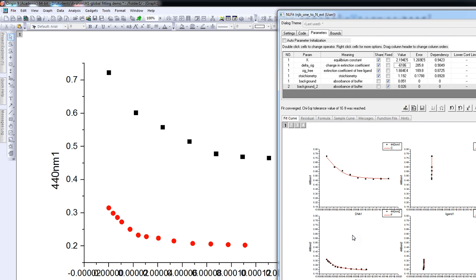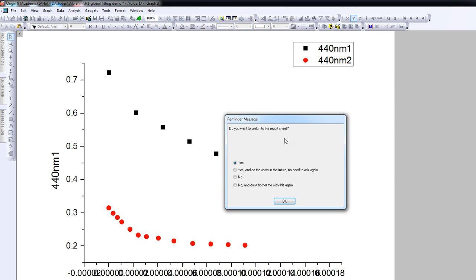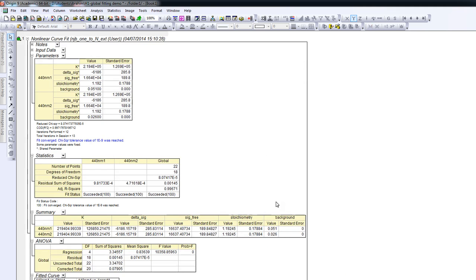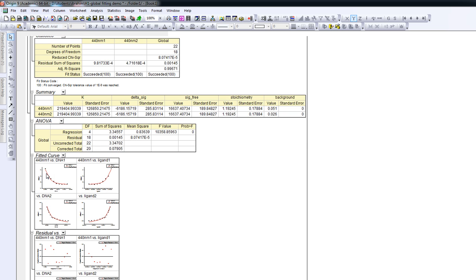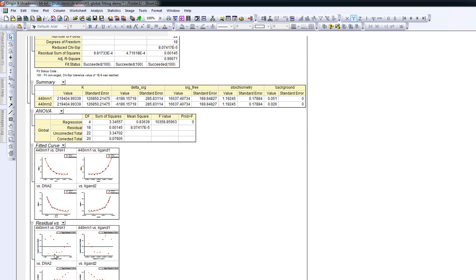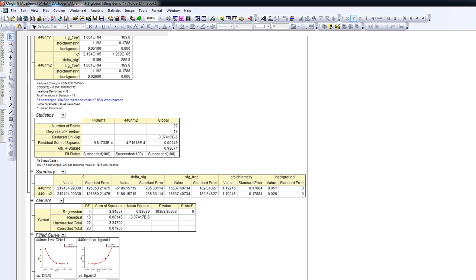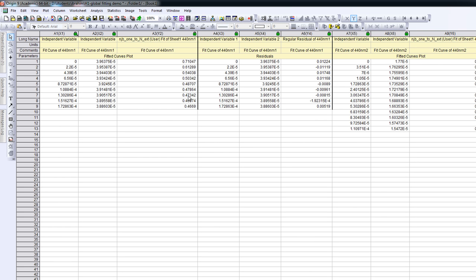So that was the fitting. We now need to have a look at the data and make sure we are happy with what it looks like. We press OK and confirm we want to switch to the report sheet. Here we get all the statistical information, the plots as a function of DNA concentration and ligand concentration, and the residuals for both plots. What we really want to see is the fit curves, which are here — these are the calculated absorbances for every data point, along with the residuals.